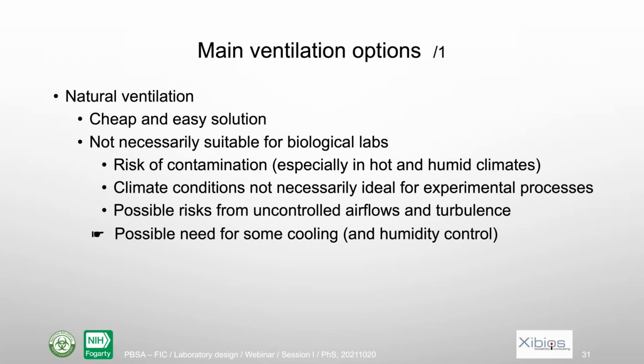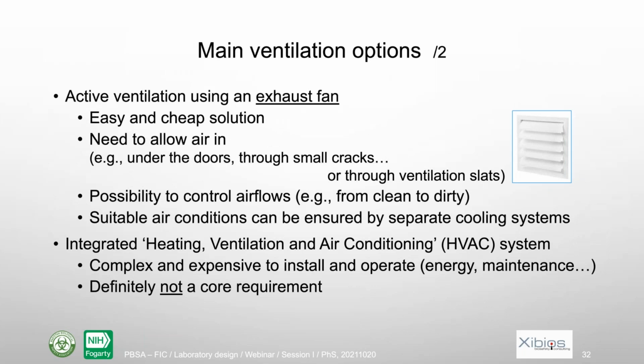If you have natural ventilation, the wind may provoke some disturbance of the air inside of the lab. And this is something that we want to avoid. And anyways, even if you use natural ventilation, you will possibly have the need for some cooling and humidity control. Still, ventilation can be used, for instance, if you ventilate the lab at moments where nobody works. In that case, it could possibly be used. But most generally, you will also need a more active option.